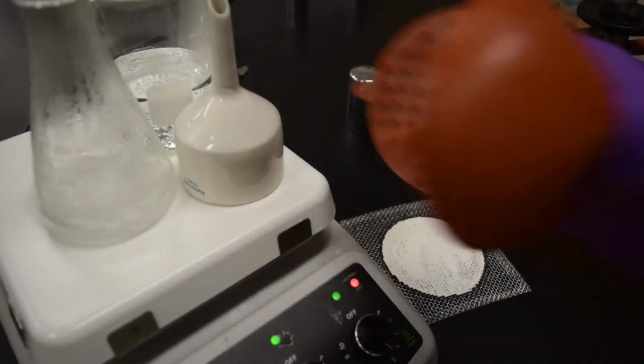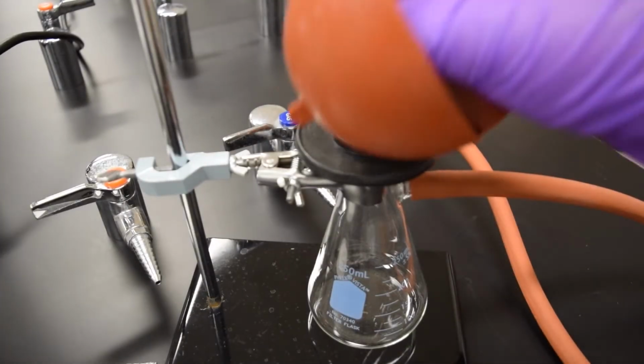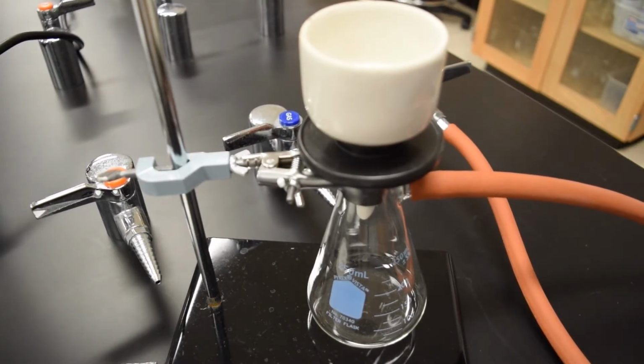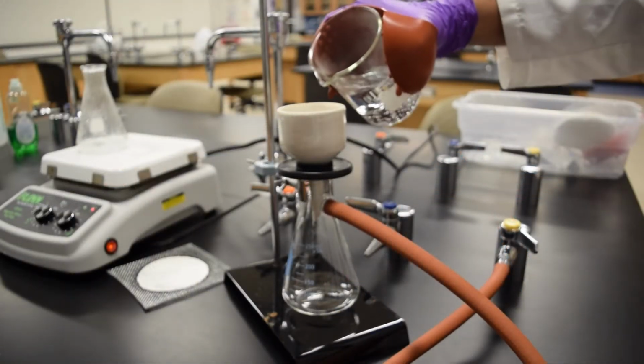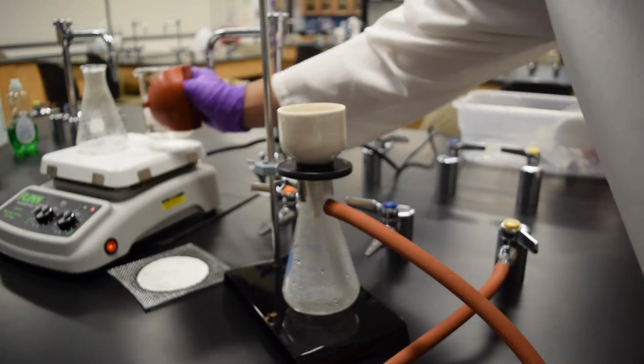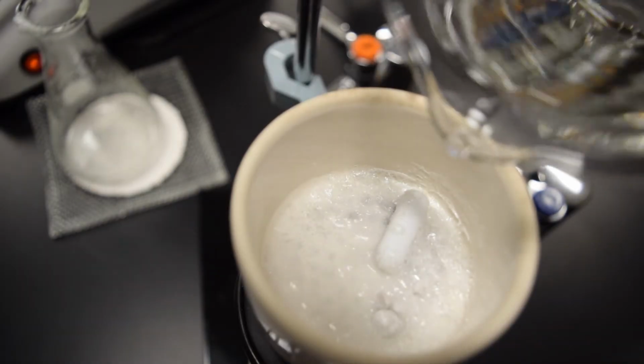Any insoluble impurities can easily be filtered out in what we call a hot filtration, using a vacuum and a Buchner funnel. This is because we want to keep the solution hot, so benzoic acid doesn't freeze out and get filtered out. We want the benzoic acid to remain in solution.